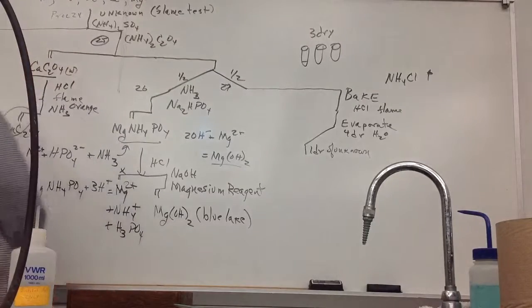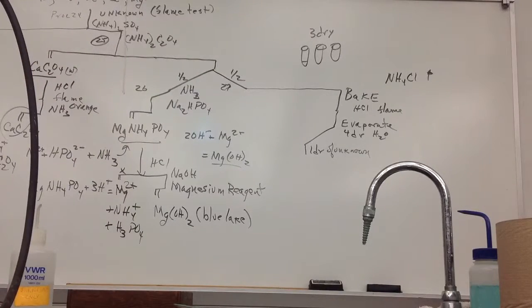Then it says add. I want to read you the sentence here. Add 2 drops of zinc uranyl acetate solution. URANYL. It says sodium reagent in some, but I actually have mine saying zinc uranyl acetate. Now, that means it has uranium. Uranium is always what?